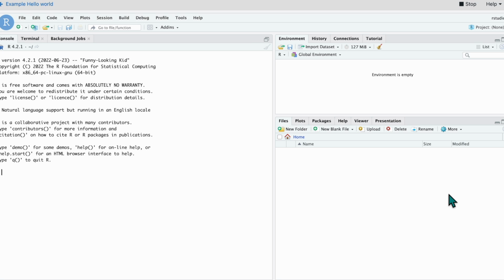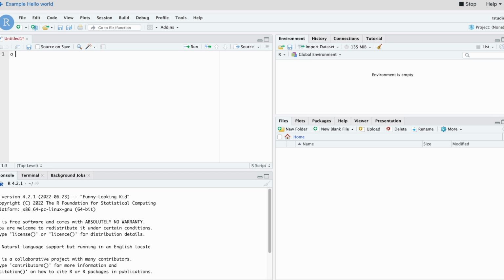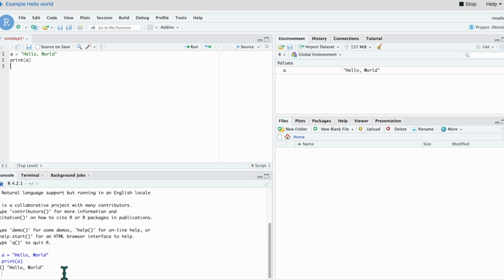Now that our Data Studio is open, you can see this is a fairly standard RStudio environment where you can add different things like R scripts, and run them in this interactive environment. Anything you can do in R, RStudio, Python, you can do here in these interactive notebooks.